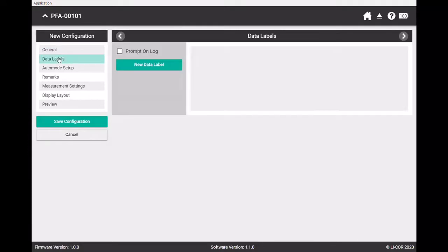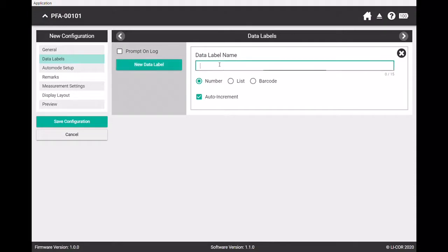We'll go down here to data labels where we are going to select a new data label. The first one here is we're going to select a barcode, and we need to give it a name. I'm going to give it treatment.